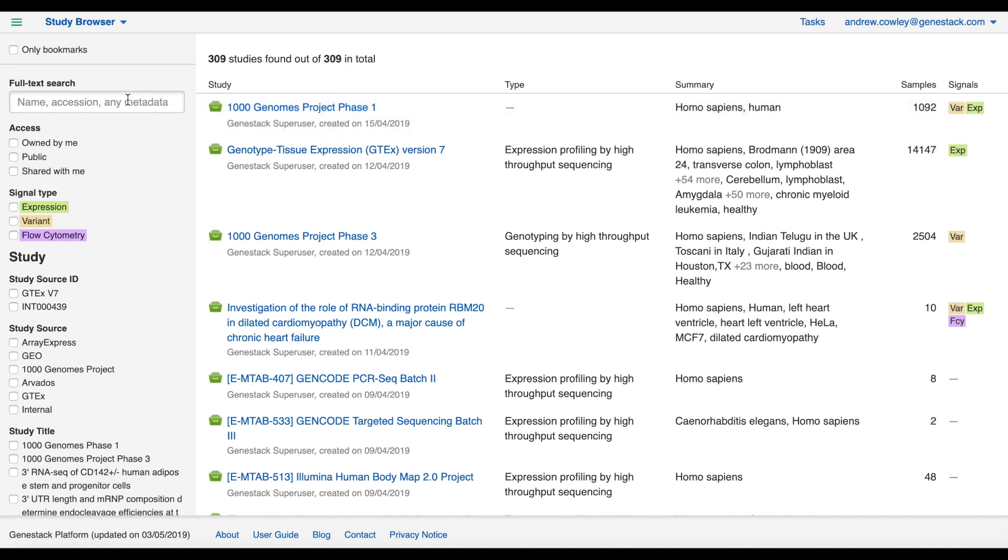Let's look at the search and filter panel next. The full text search is a good place to start. Here you can search by the name of the study, the accession of a study, sample, or signal object, or by any text that's in any metadata field across all of the data you have visibility of. Let's try searching for the text dilated cardiomyopathy.